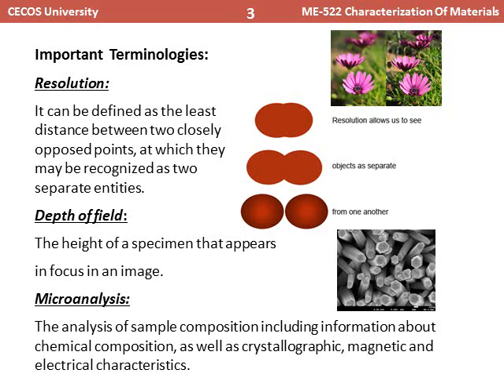So these three terms we will be using very much in the scanning electron microscopy technique. The resolution, which means how easily you can distinguish two objects which are closely packed to each other. Second is depth of field. You can visualize the height of an object, but it will not give a true height. And also you can see the composition of the structure, what the structure is made of. You can also see this composition by scanning electron microscopy if we couple an additional tool to the scanning electron microscope, which is called EDX.